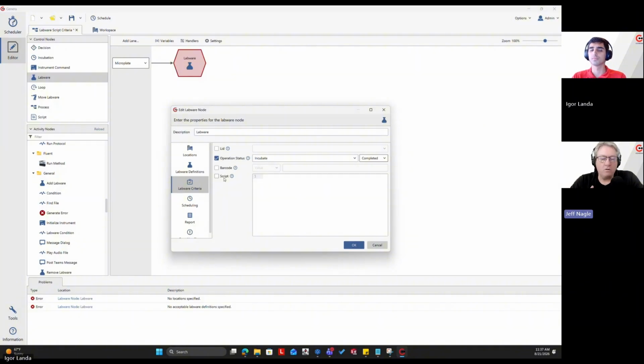If you're looking for Labware that has a specific operational status and Genera, in the context of a process, doesn't find that status, it won't process any plates until that Labware sees that state, which is really another controlling method within the software itself. So that's really advantageous.